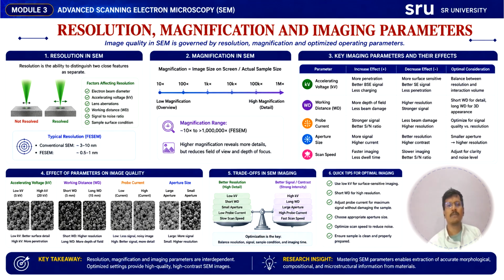However, it is important to remember that magnification alone does not guarantee image quality. Increasing magnification without sufficient resolution simply enlarges a blurry image. Therefore, resolution and magnification must always be considered together.